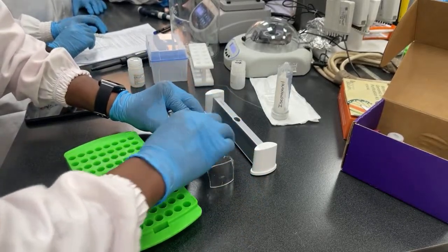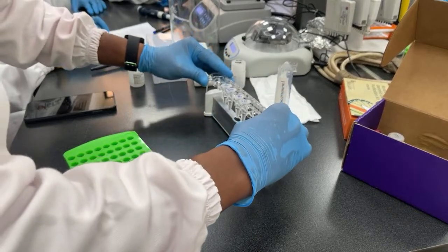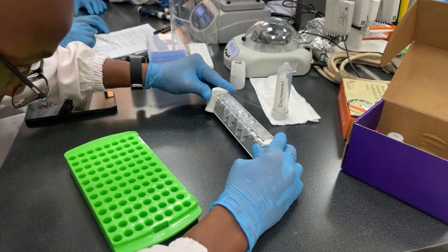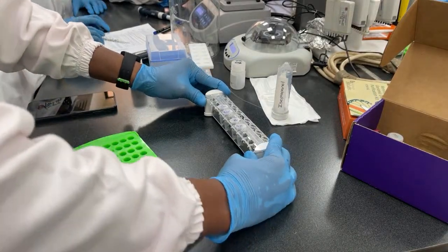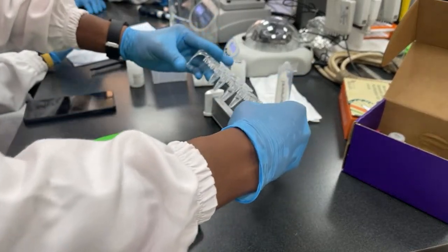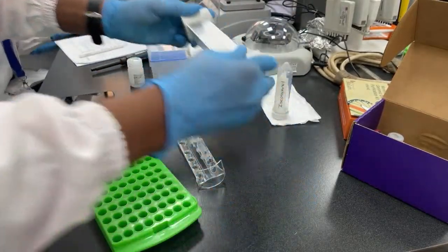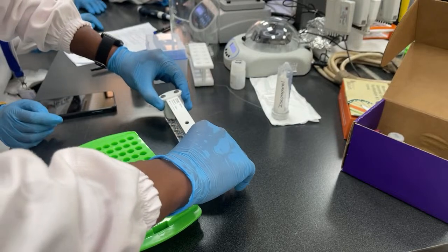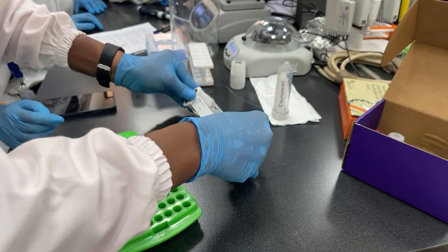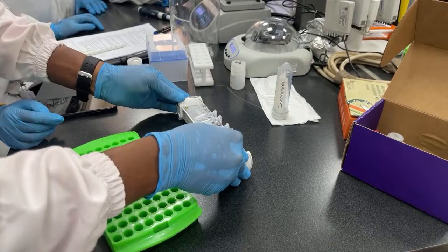Where is the growth? Can you put it back? Or we do like we did the last time again. Like this? Okay, and do this. Washing 4 times. No, we inverted and then removed again the excess liquid.